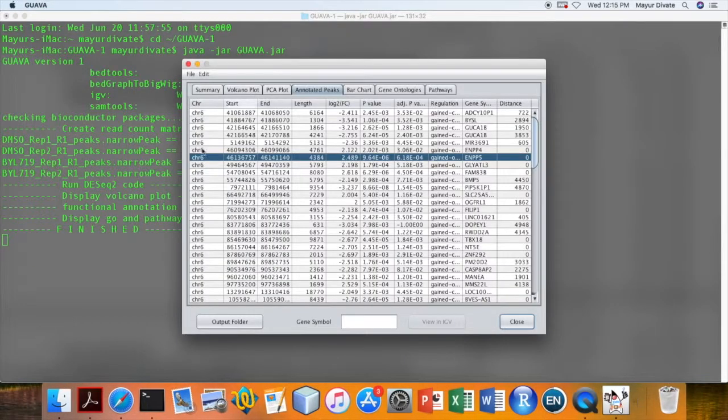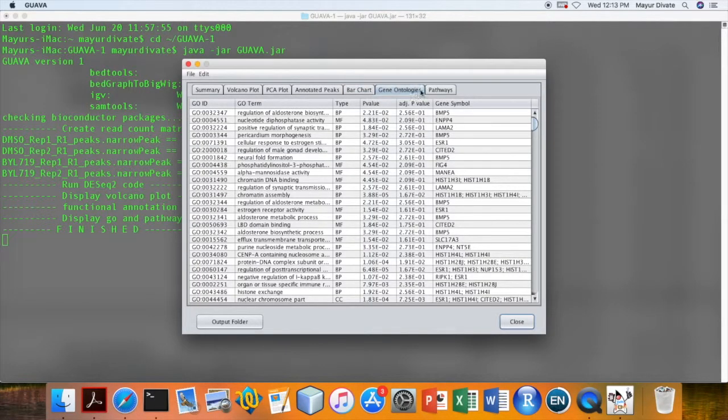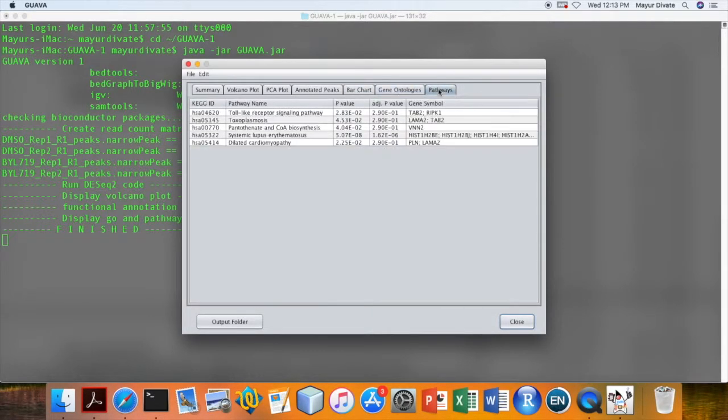And then next tab contains the bar chart showing the peak distribution in different chromosomal regions, and then gene ontologies and pathways.